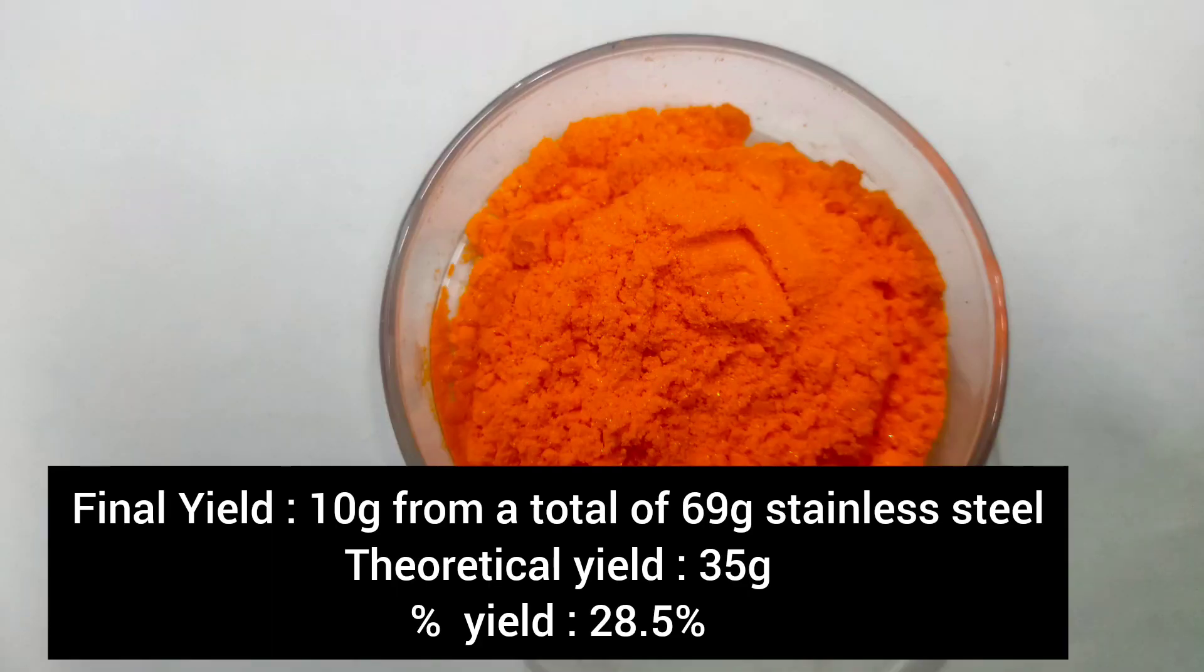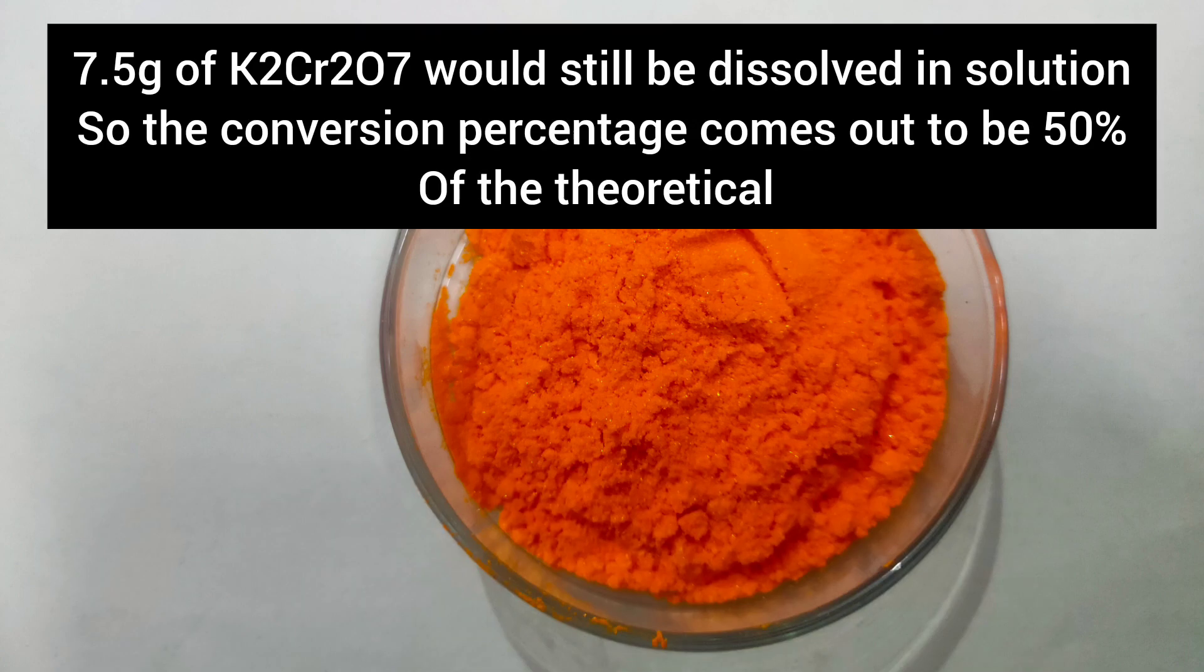After drying, yield came around to be 10g, the theoretical yield being 35g which corresponds to a percentage yield of 28.5%. 7.5g of potassium dichromate will be there in the solution. Taking that into account, the conversion was only 50% of the theoretical.